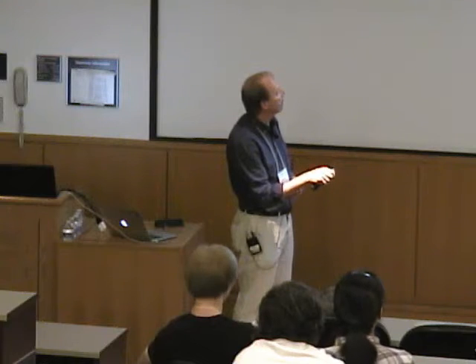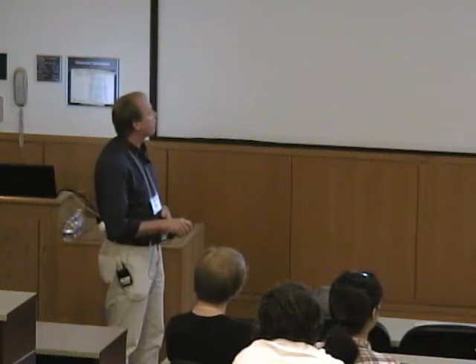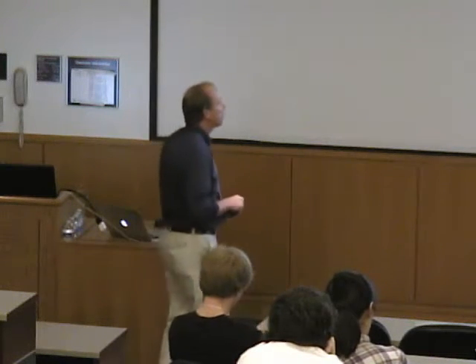And then if I go back and look in the data set at some particular time, I can extract a spectrum of the triplet state. And so this is the spectrum of a porphyrin molecule here. What's interesting about this method is that the generation of the triplet selectively populates these levels. And there are really two general ways that this can occur. We can wind up with excess population in T0 or excess population in T plus and T minus 1, and this depends on the pathway by which the triplet state is produced.